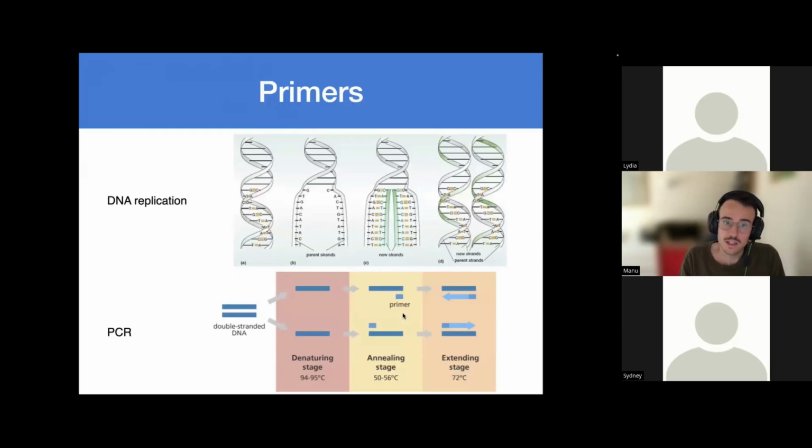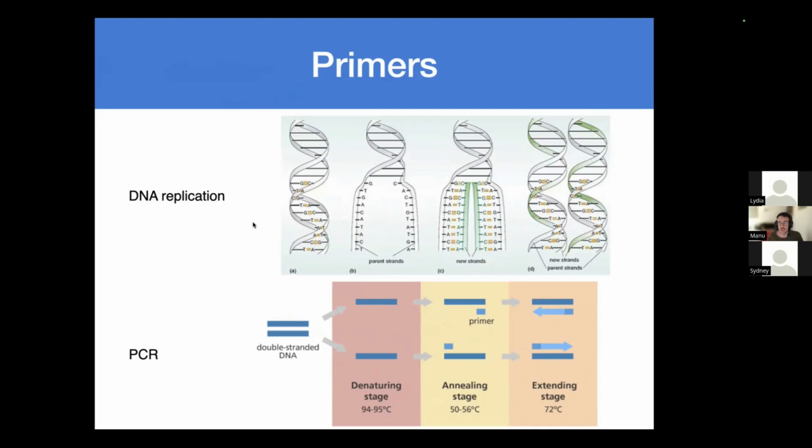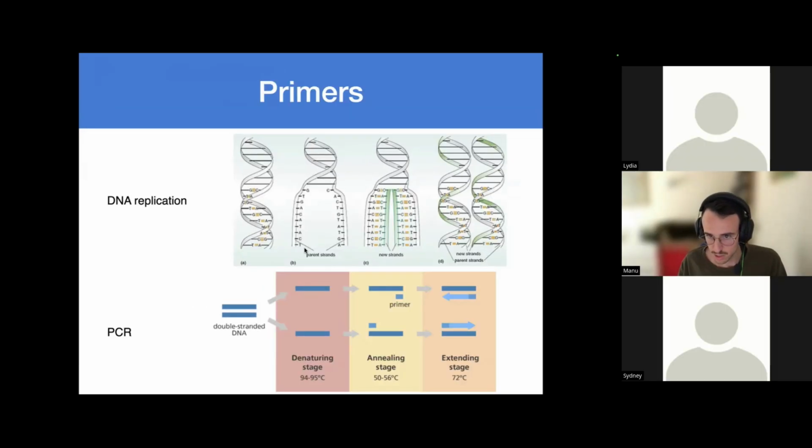The other thing I want to say is that apart from sequences, the users of eLabFTW who are doing molecular cloning will typically use something that is called a primer. So there is also support for this. A primer is a short fragment of DNA. If you remember from your high school textbook, the way that DNA replication occurs is that you have a helix that is complementary. Something in the cell separates the two helixes, and then the cell fills the gaps with complementary sequences to generate two identical copies of the original one.